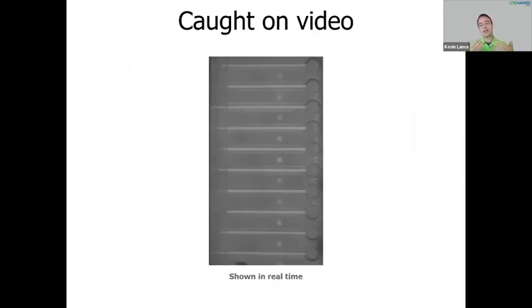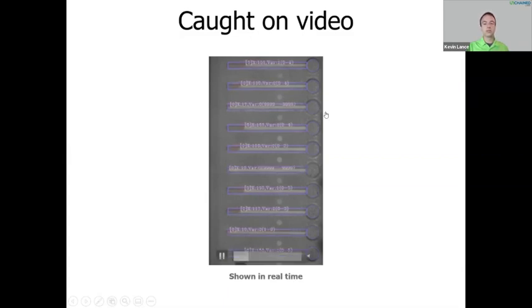This kind of data is exactly what you get to see, and it's what's saved after a run of viscosity on Honeybun. So what we're looking at here is that video capture of 10 measurement channels, where the top sample is water, the second sample is 2 centipoise standard, and the third sample is 10 centipoise standard, and that pattern repeats down the rest of the bun.